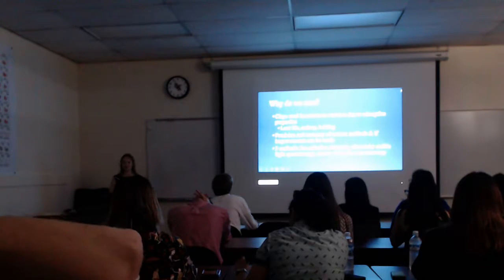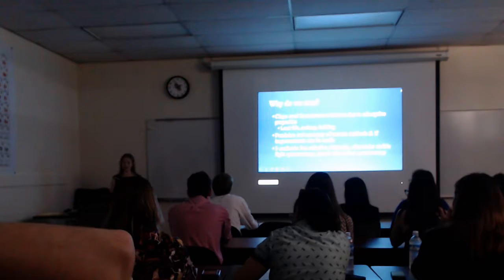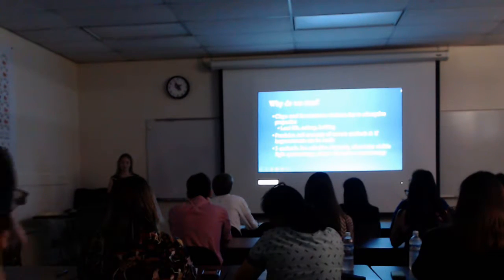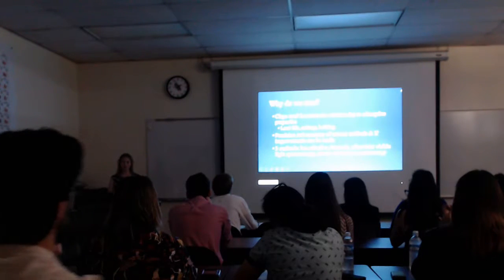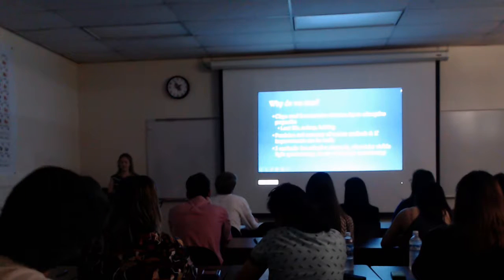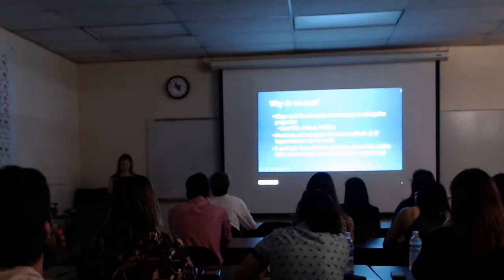We wanted to see if we can improve on these methods so that they would be more precise and more accurate. The methods that we were looking at are 3 of many, and these were the ion selective electrode, particularly the ammonia gas selective electrode, the ultraviolet visible light spectroscopy, and the atomic absorption spectroscopy.